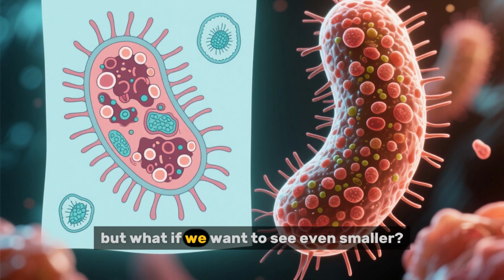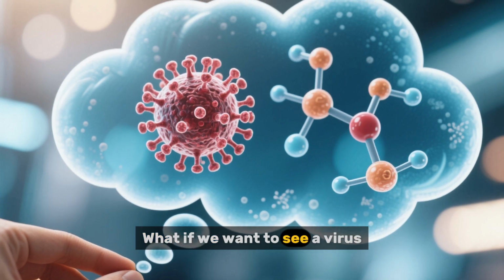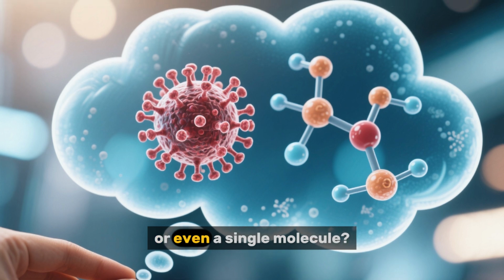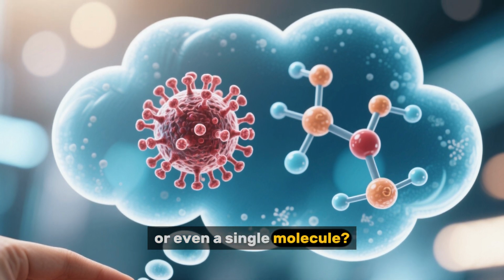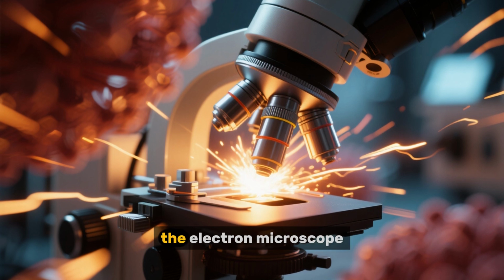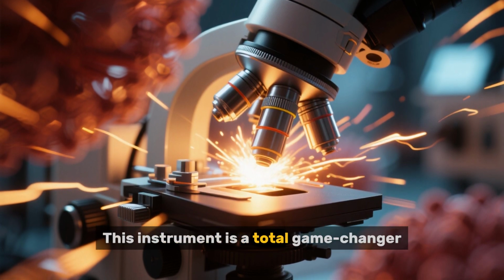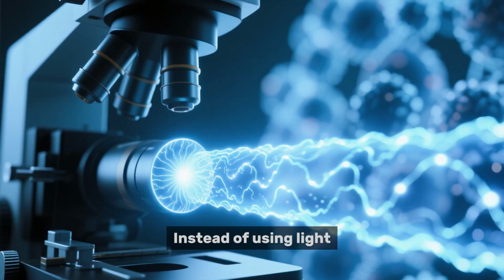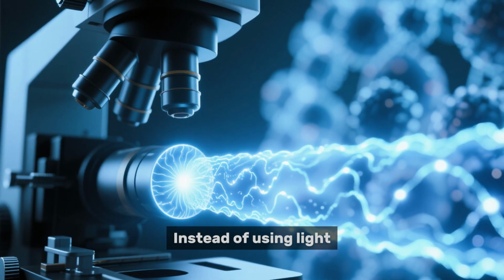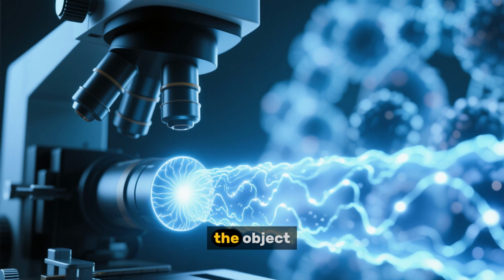But what if we want to see even smaller? What if we want to see a virus or even a single molecule? For that, we need to bring in the heavy hitter, the electron microscope. This instrument is a total game changer. Instead of using light, it uses a beam of electrons to see the object.